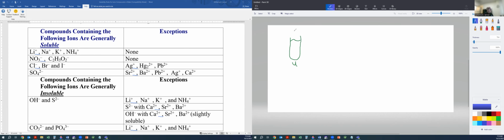In the first step of the lab, I put in 6 molar hydrochloric acid, HCl, which, remember what I taught you guys, that's code talk for primarily 99% water, and then a bunch of chloride ion and a bunch of hydronium ion that I'm putting in there.